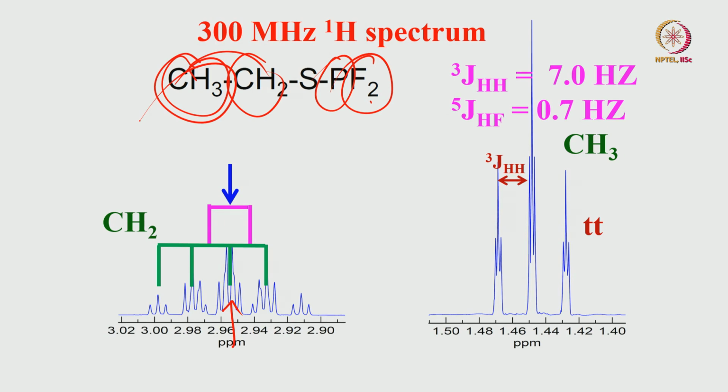The first largest coupling I took to be HP, which is very large, and each line of the doublet becomes a quartet because of coupling with the CH3 protons. This is one quartet, another quartet. I have deliberately put two different colors.